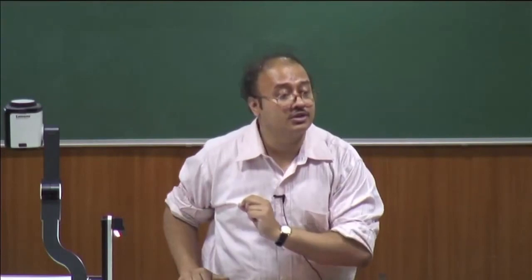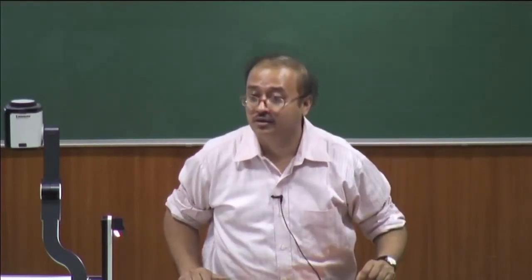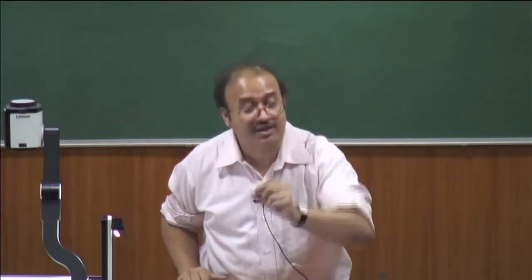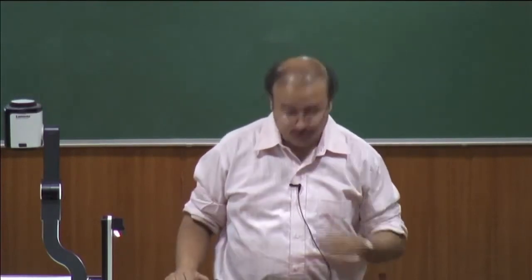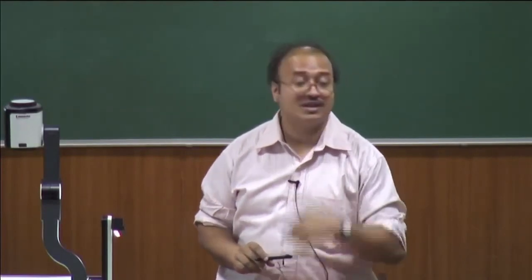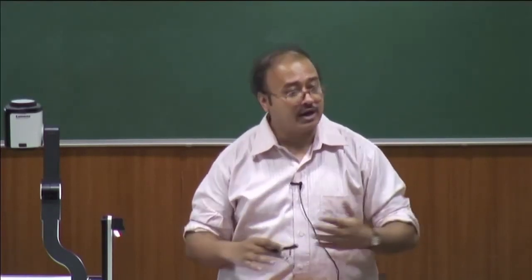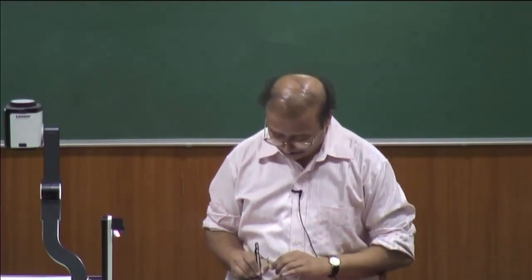If you would ever think about this while you're doing an experiment, you would see that the experiment becomes a lot better, because you understand it a lot better now. You have a personal feel about that experiment, and that's why it's so essential for you guys to know what is there inside the box you're using, without just treating it as a box. Okay, so that's why I'm taking this time to show you the optical layout, which is nothing out of the ordinary. It's just some very ordinary components you put together, right? Obviously, expertise comes in terms of manufacturing these things, and then you put them together as a fluorometer.